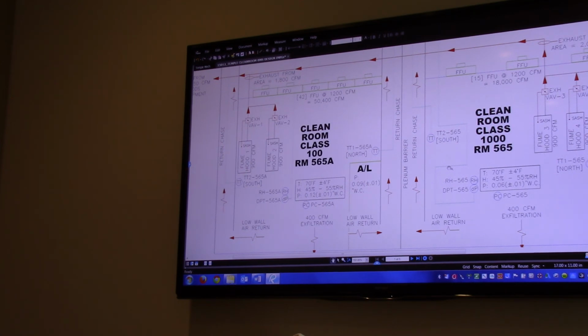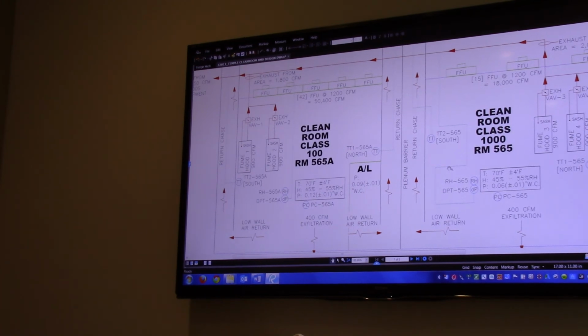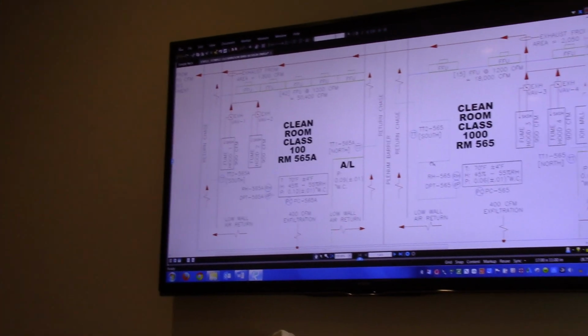Right, because you're trying to maintain a set velocity on a certain sash height, right? Is it constant volume? It's constant volume, I understand. But inside of the hood, it is a separate fan? Yes, totally a separate fan, outside of the circulation, right? It's just an exhaust. I assume it's going outside the building.